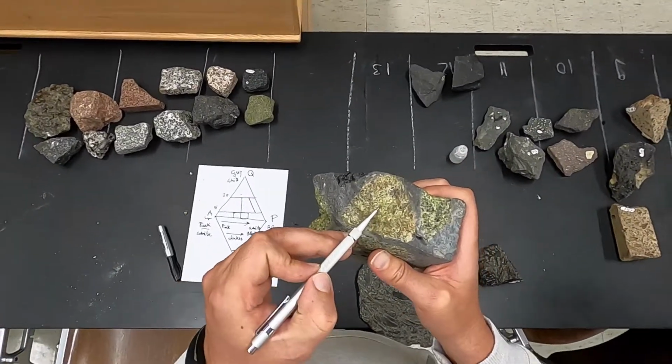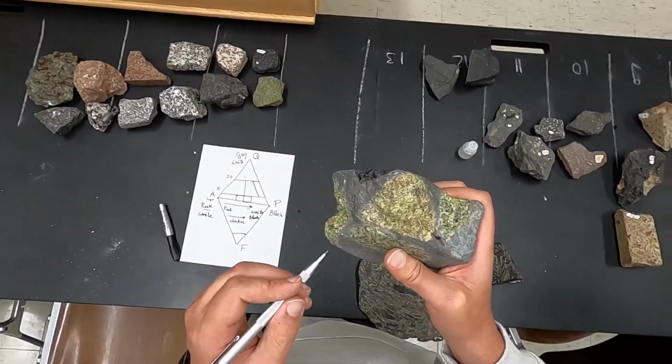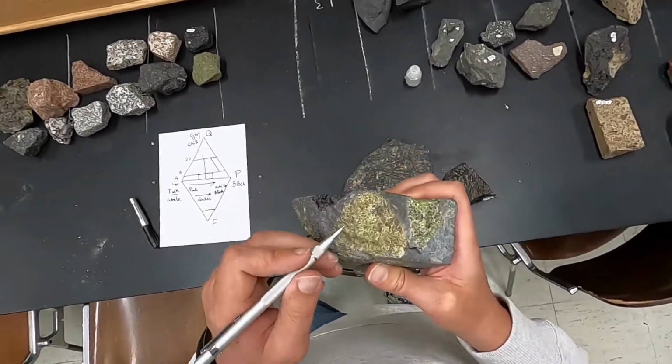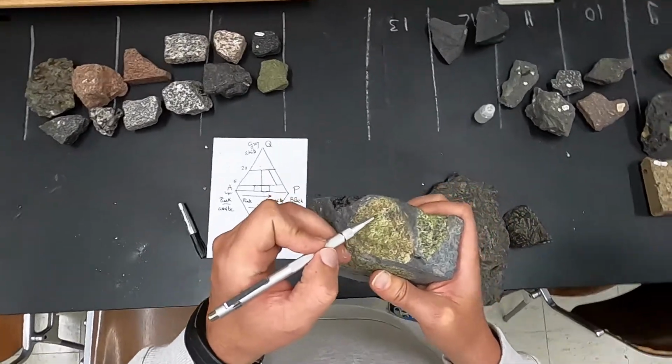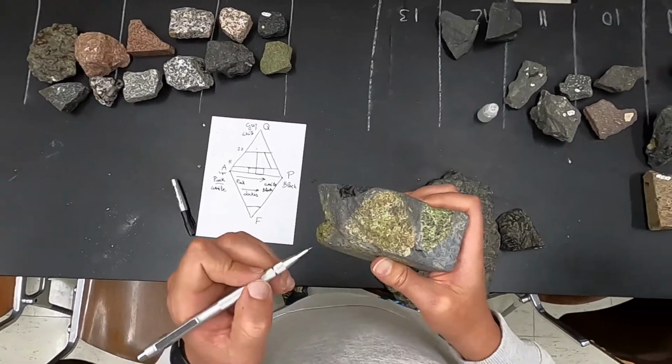So the light green to olive green is the olivine, which is highly abundant. And then the dark green will be diopside, so pyroxene.